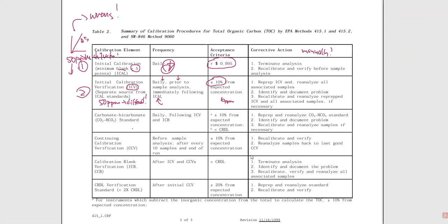Well, you're going to key in 6 to your calculator, and you're going to put plus 10%. And then you're going to hit enter and write down that number. And then you're going to hit 6, and then you're going to do minus 10%. Write down that number. And that is your window. This value should fit within that window.